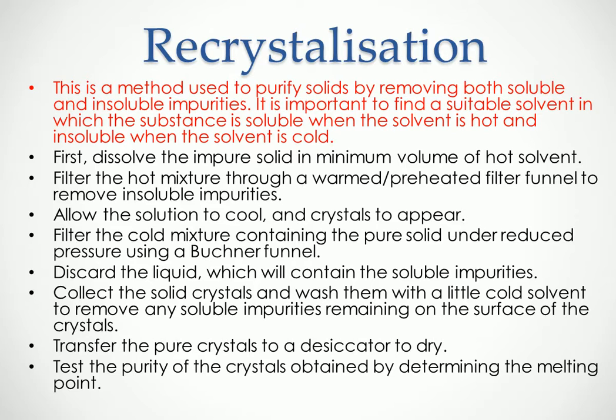But you should also note that we use a little cold solvent, and we don't use a lot though, we use a small amount, so that the crystals aren't washed away. Okay, because if we've used too much, the crystals might be washed away and we've basically ruined the whole process.